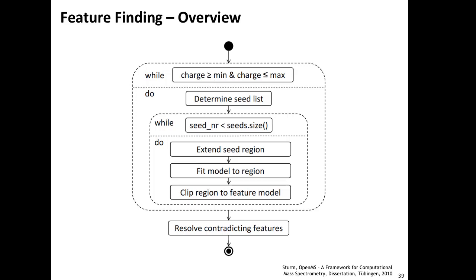And that is one of the parameters of the algorithm. If you expect your peptides to have a higher charge, say because you introduced a modification or whatever, you can change that. We basically search for each of these charge states independently for a multitude of reasons.